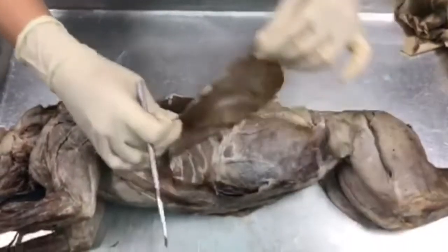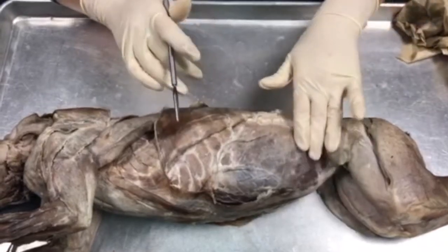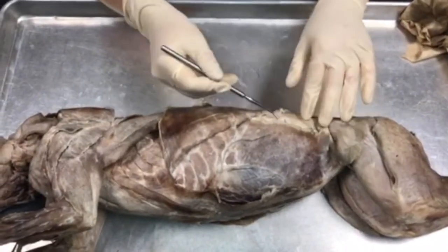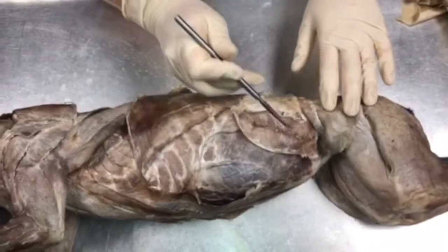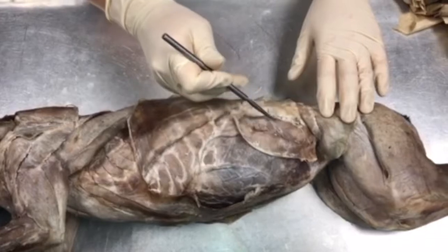If we pull this back, we're going to expose this muscle right here, which is going to be known as your internal oblique. If we flip this thin layer back of your internal oblique, we'll expose this muscle right here, and this is going to be your transverse abdominis.